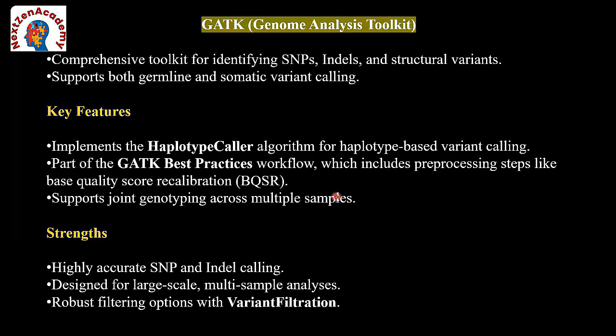It also does base quality score recalibration. It is also helpful to do joint genotyping across multiple samples. If we have a thousand samples and want to call the variants across all of them together, that kind of study is where GATK has its strength.